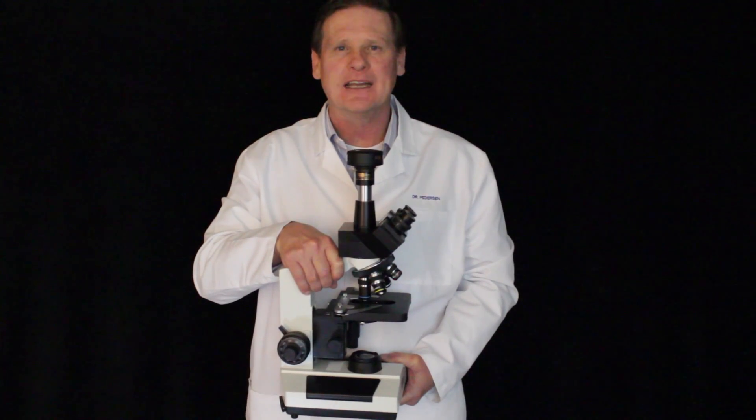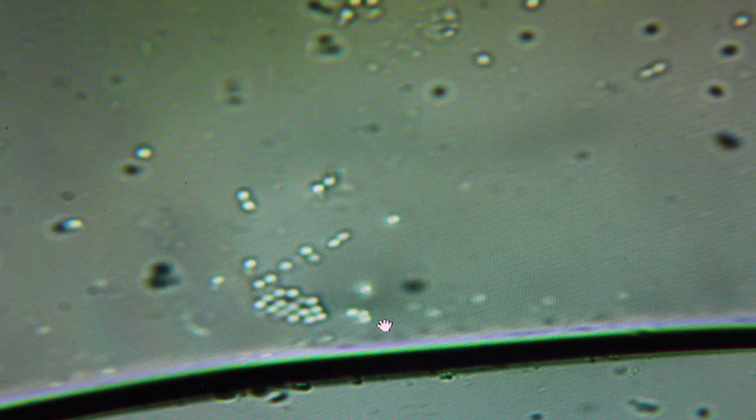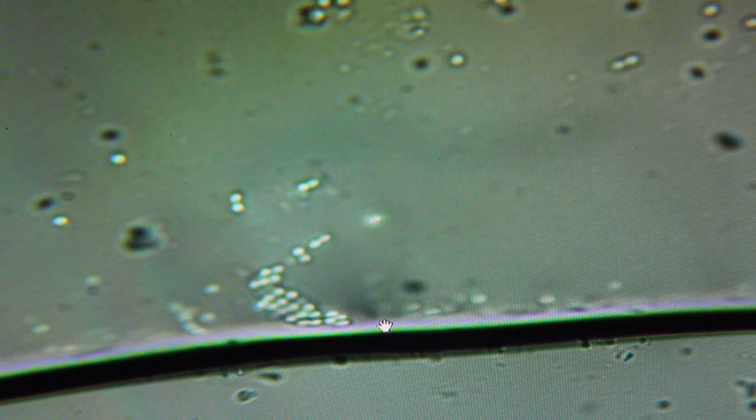It happens very quickly. Here it is. What you're looking at here is bacteria as it approaches a silver line. The black line is silver moving across the slide.